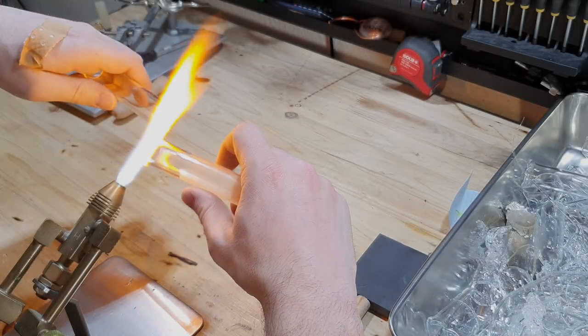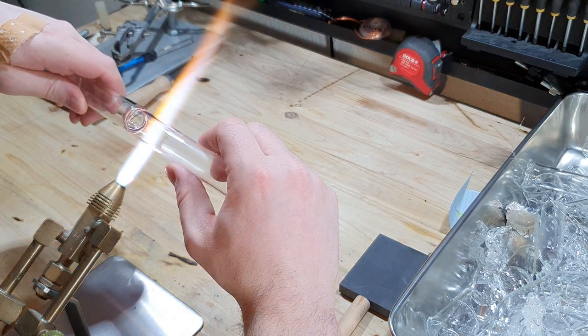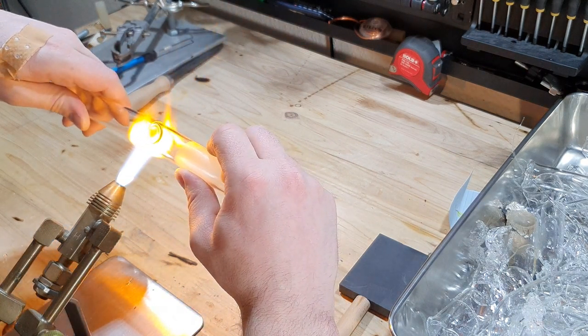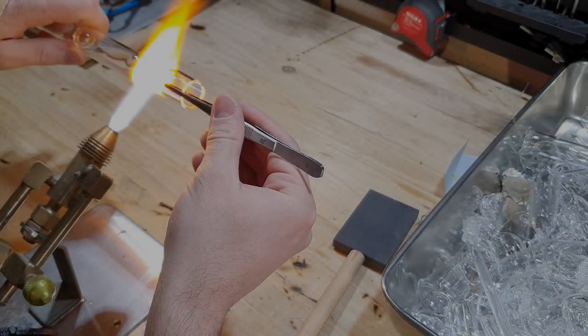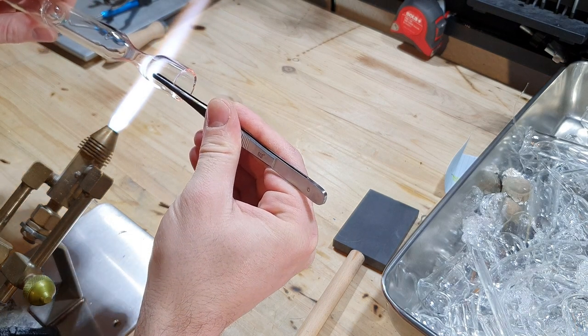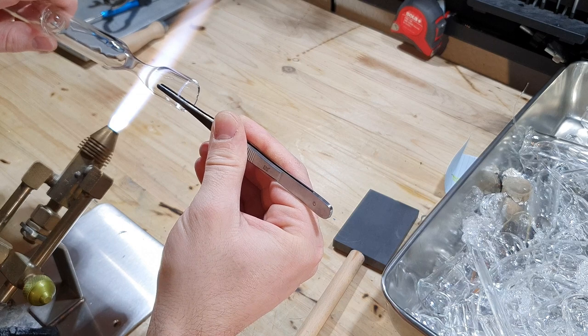Without letting the glass cool down, I connect another piece of borosilicate glass tubing to my brake seal. The last step is to create a neck so you can seal your ampoule easily after it has been filled.